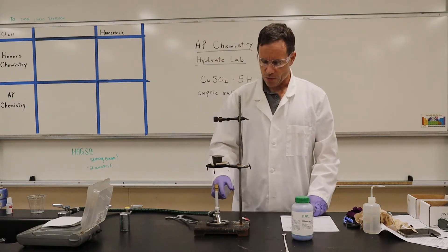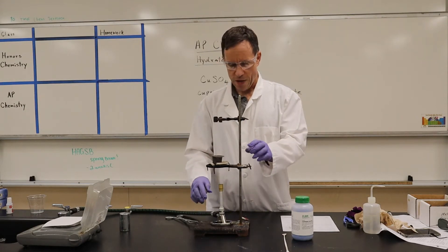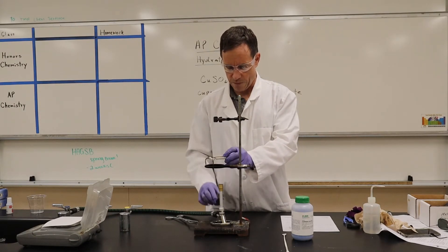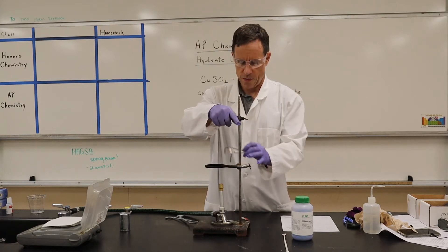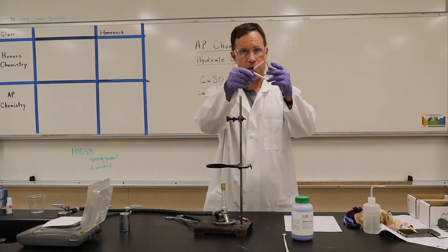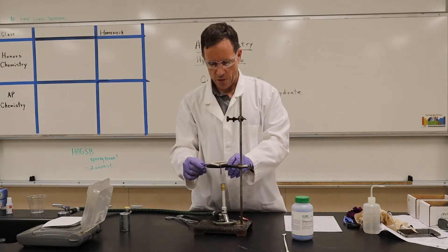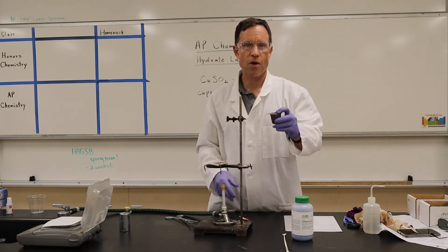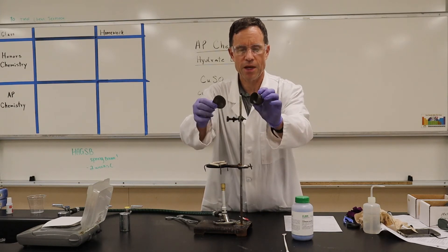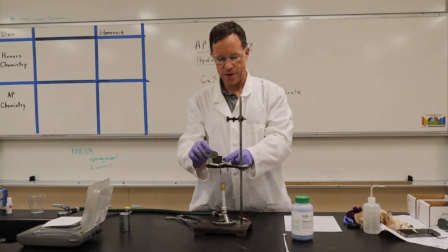What we use here is a Bunsen burner. And we have a ring stand. On the ring stand we have a triangle — you can push the triangle to make it a little bit smaller if you need to. We're going to be using something called a crucible. The crucible is a little thing that looks like a teacup. It's metallic and has a little lid to it, and we're going to be putting that inside the triangle.